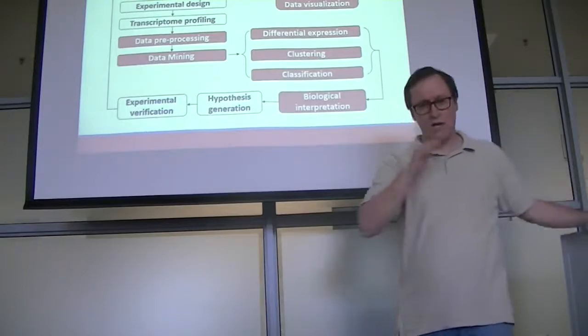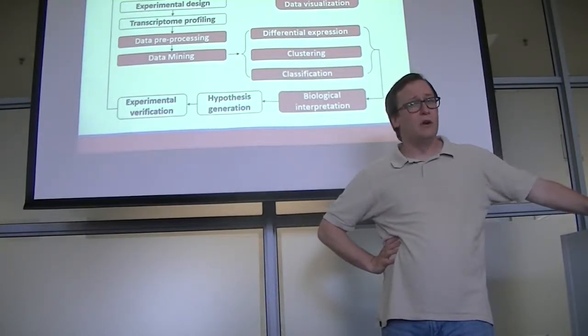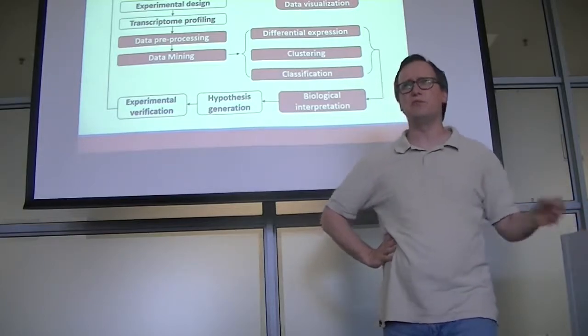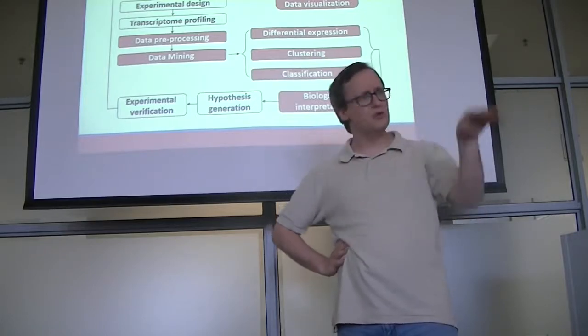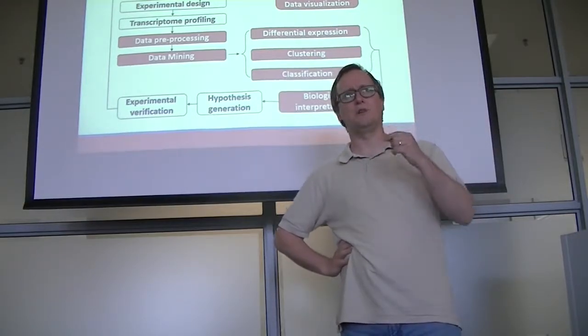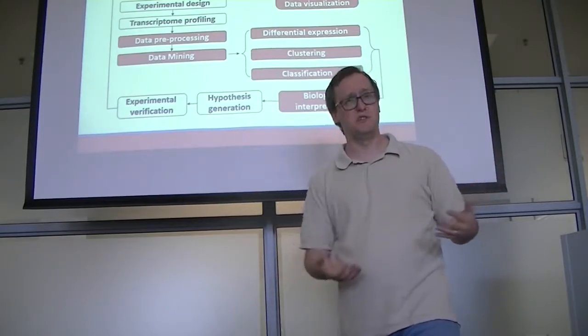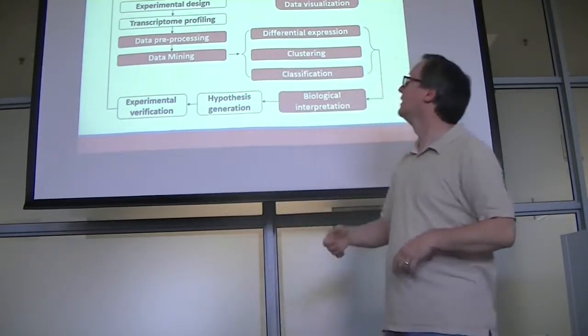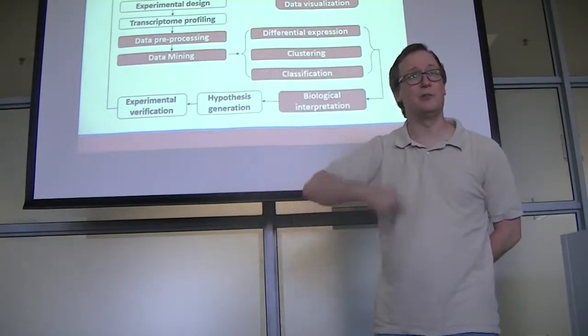All right. Now, there are an awful lot of different ways that you see people working with gene expression data. For most of the rest of this talk, we'll really be talking about the case where we have known transcripts for the organism and we're trying to figure out how much each of them is changing in response to some sort of biological difference.